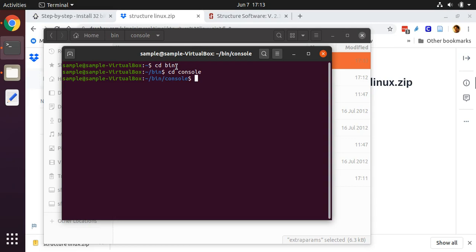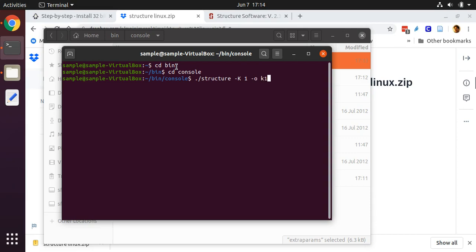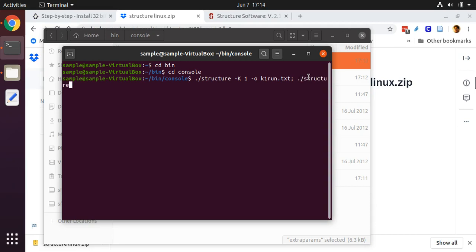Here is how you run STRUCTURE. That's the command, and then we're going to tell it how many k groups we want. So we want to run STRUCTURE first for k equals one group, and we'll make the output file k1_run.txt, although we could call this output file anything that we like. I'm going to use a semicolon so that we can run multiple different STRUCTURE runs one after the other.